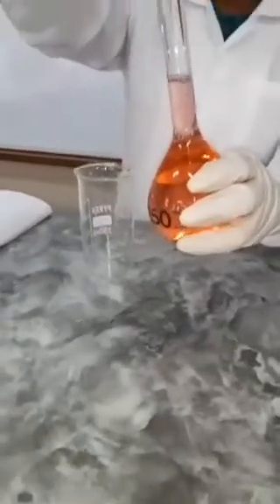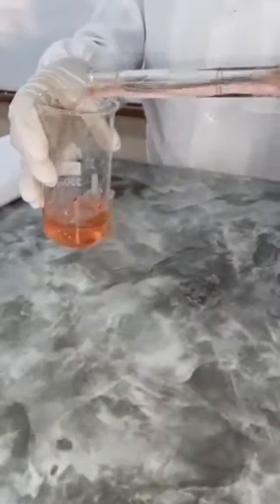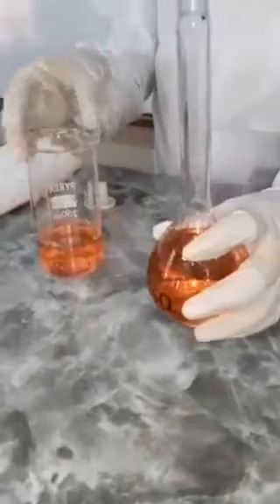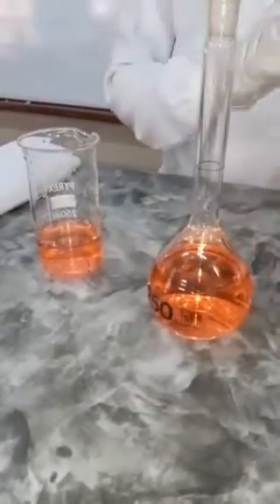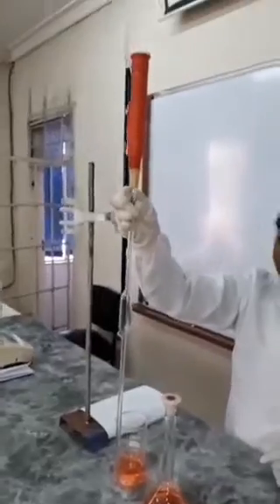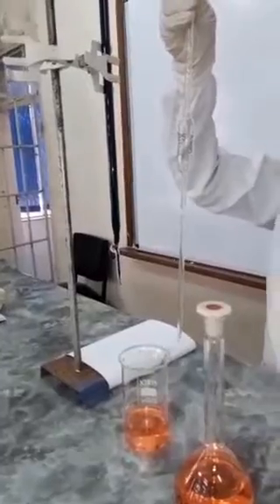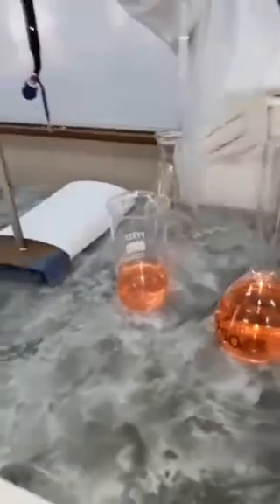So after shaking, mixing everything, we're going to pour or transfer a bit of the solution, our iron sulfate solution, into a beaker in order for us to pipette properly. So I'll use a 25 mL pipette, and I'm going to pipette exactly 25 mL of the filtrate, and I'll transfer it into a conical flask, and then I'll proceed with the titration.